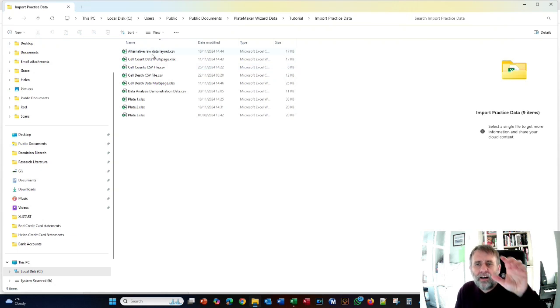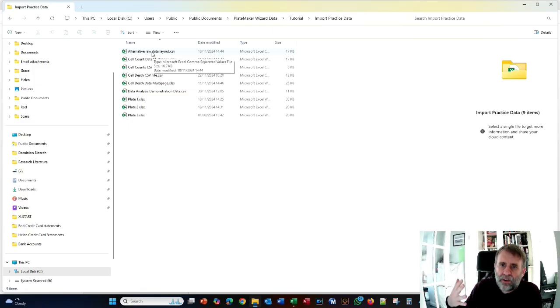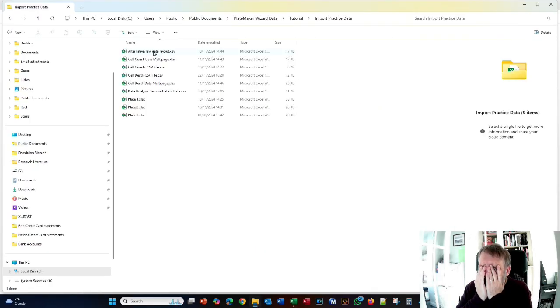Now the reason why I have put the data in all these different formats, even though it's the same data, is because I don't know which way your plate reading machine will return data. So in general, you'll be using some form of a plate reading machine, whether it's a high content screening type instrument like an array scan or an in-cell analyzer, or you might be using some sort of ELISA reading instrument which records absorbance, or something that's doing ratio analysis. Whatever you're using, the point is it's going to be returning data to you in some format of a 2D matrix of numbers. And often these machines are quite basic.